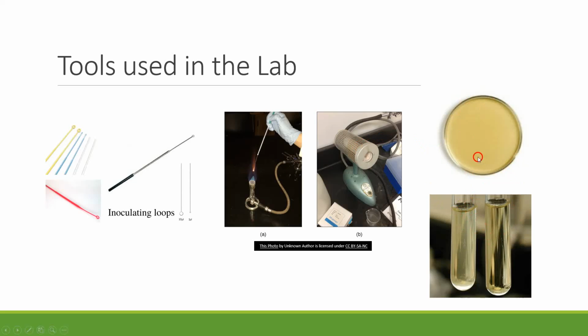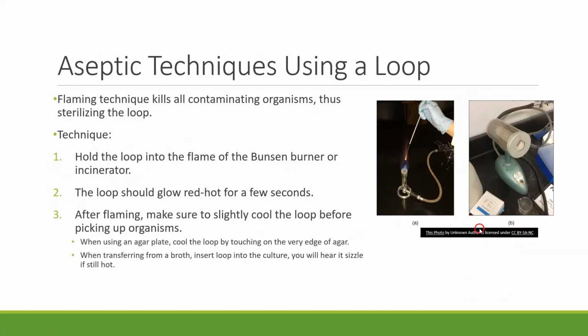And then, of course, as I said, we're going to have the media that we're using in the labs. So it can be a petri dish where it's going to be a solid media, or it might be in test tubes where it's going to be a liquid media or a broth.